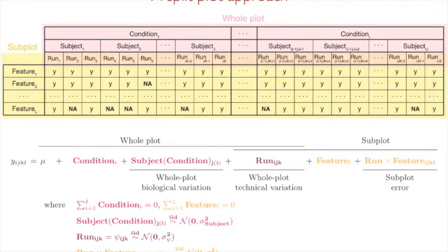And so I will not do much math. I just want you to have the keywords behind it, right? And the good news is that MSstats does all of this behind the scenes. You don't need to worry about that. But just so you know what's going on, we take this table for one protein, and we partition this into two components. One is the yellow component, and the other is the pink component.